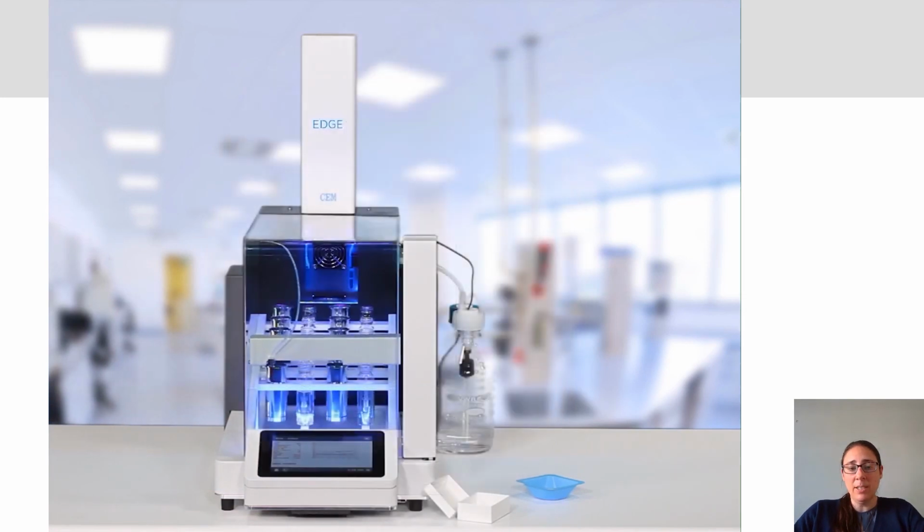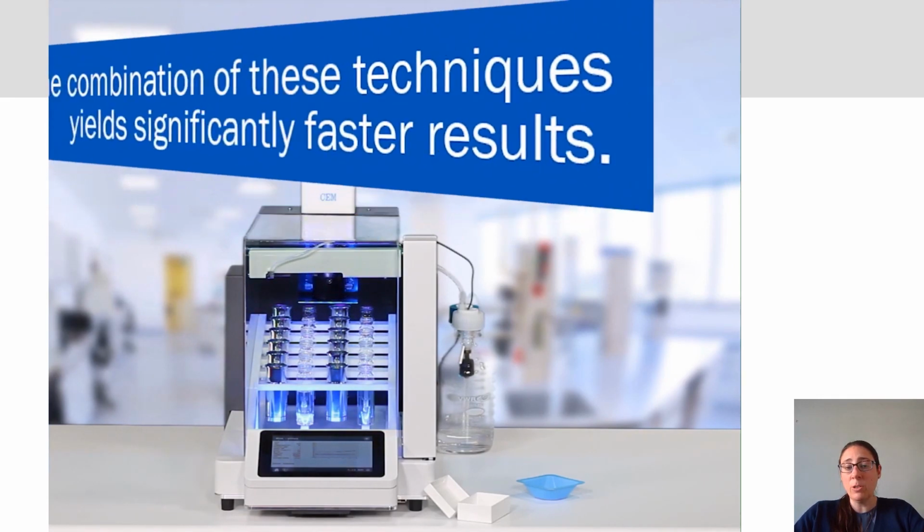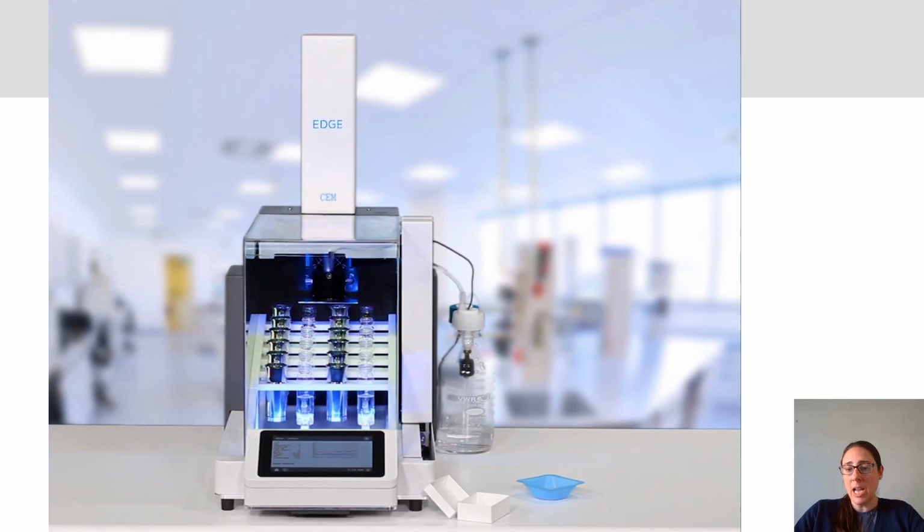And then we're going to see the system do that here. That waste, you see that waste bottle on the right in the back there, and you'll see that automation come back there and go to the waste port. And so that needle that just dispensed your sample is being washed. The entire fluidic pathway is washed. At this point, you would move on to your next sample, or you're done.